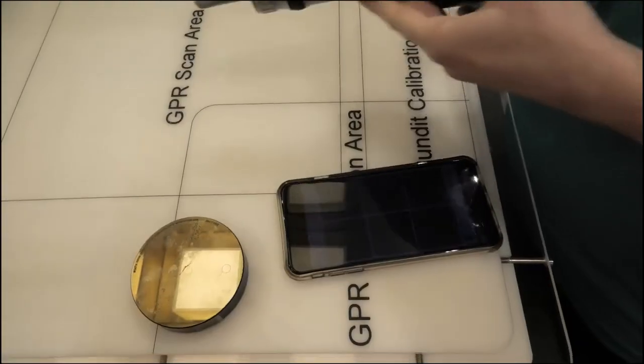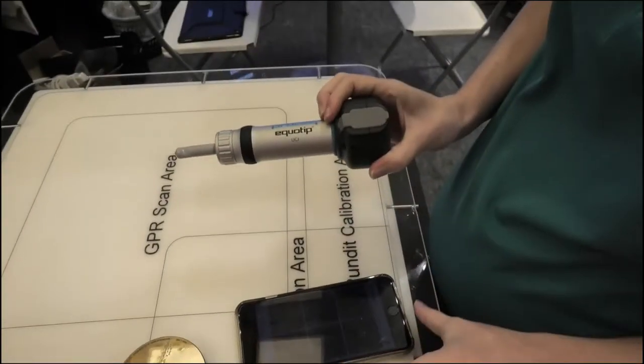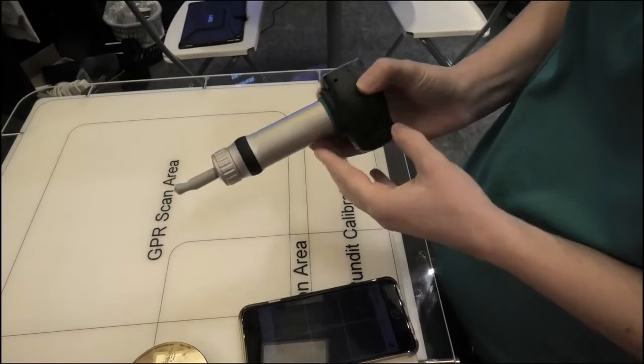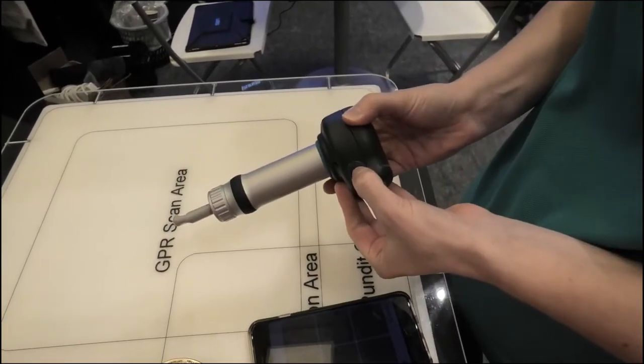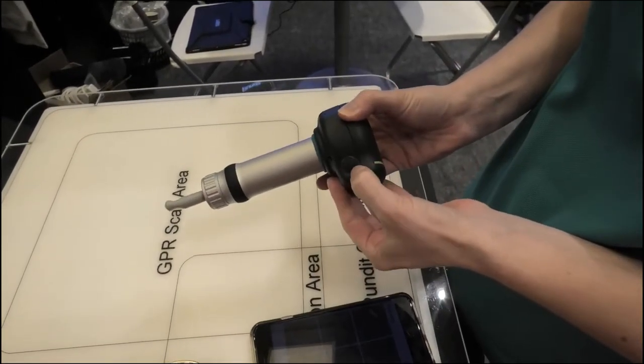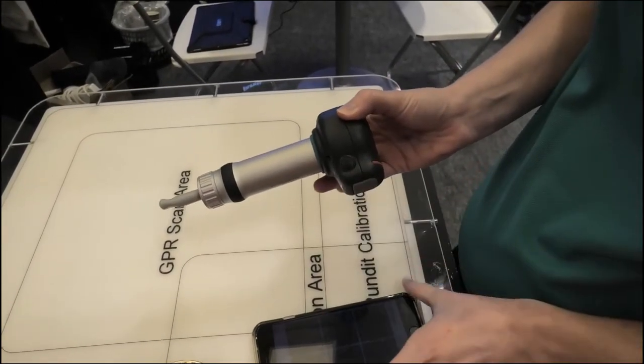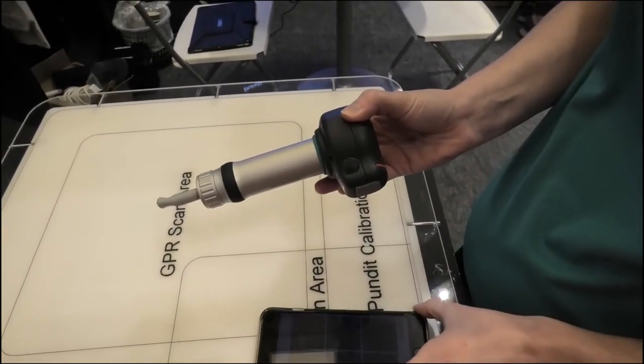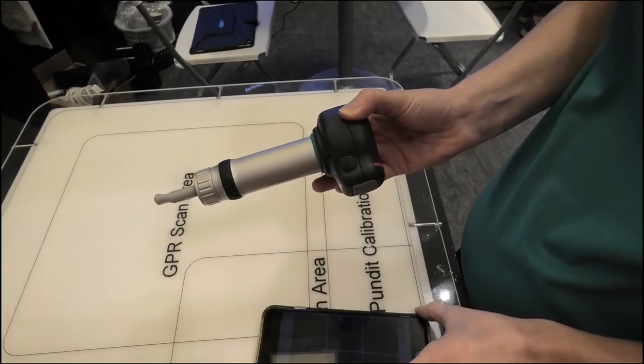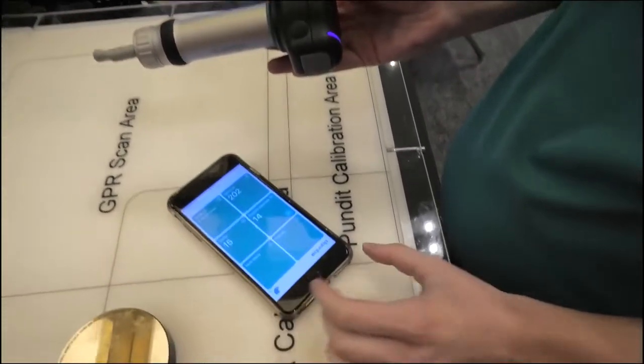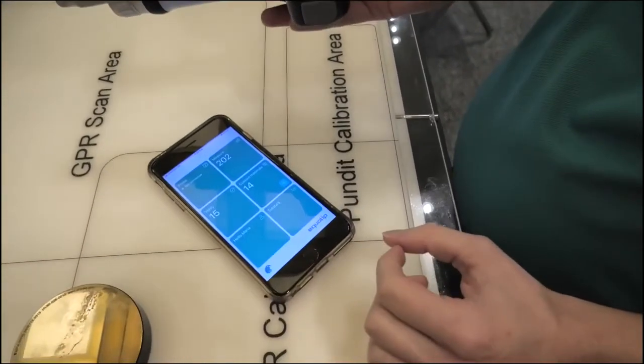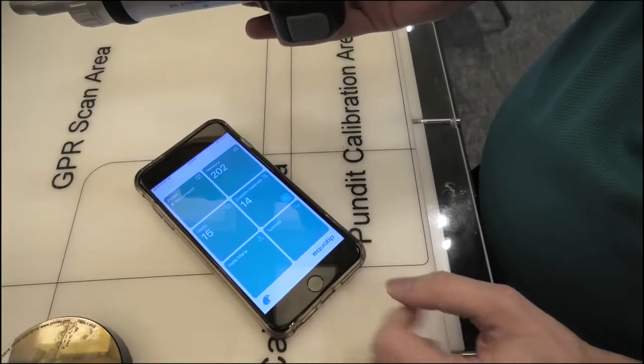The Equitip Live UCI probe, we switch it on from here, and then we can connect it to the app on an Apple device.